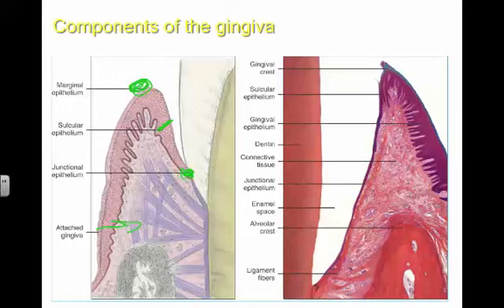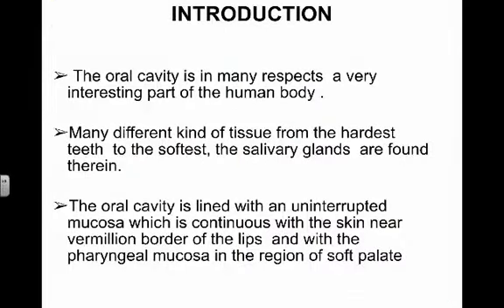This is really the weakness for me in the whole tooth structure. Here's your enamel space. Here's your crest, as you will know, and the unique type of epithelium we have on this side versus that side, and the change in junctional epithelium. So we're going to take a look at that, and here are your alveolar crests, as you well know. So it is, I have to put it down, this is what you're doing for a living, so it's an interesting part of the body for the most part.